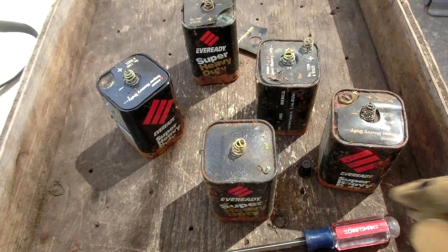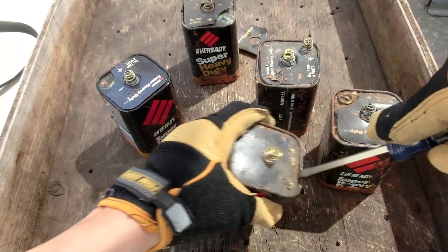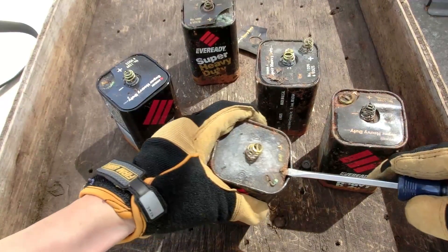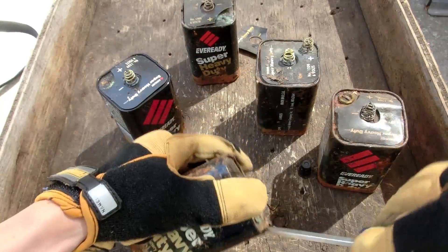Let's grab one and see if we can open it up. I'm kind of curious to see what's exactly inside these batteries, but also there should be some graphite electrodes in here.